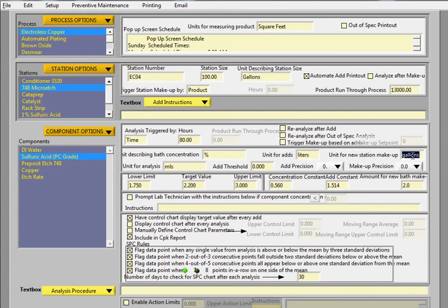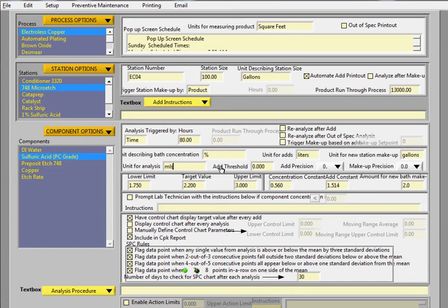This is kind of nice because some labs operate with metric and standard SI units. And it gives you a little flexibility that you might need. The unit for analysis field is here. And in this case, it's milliliters and or mils and threshold.